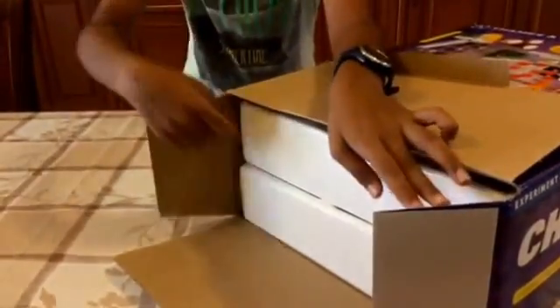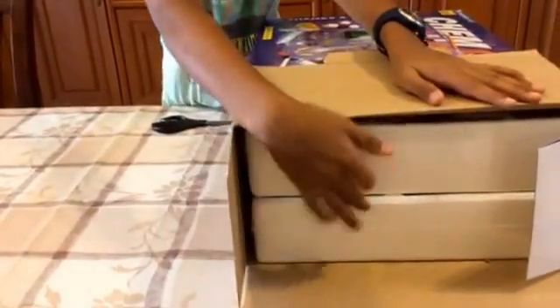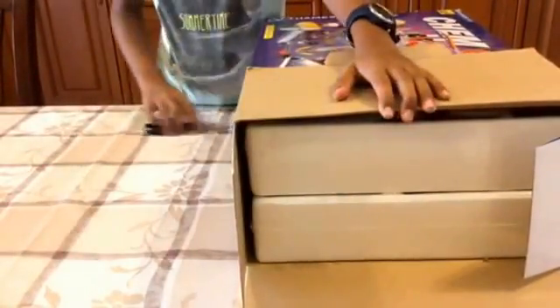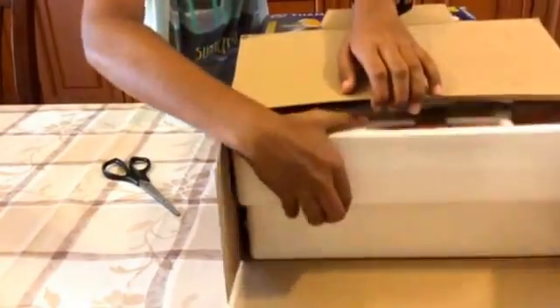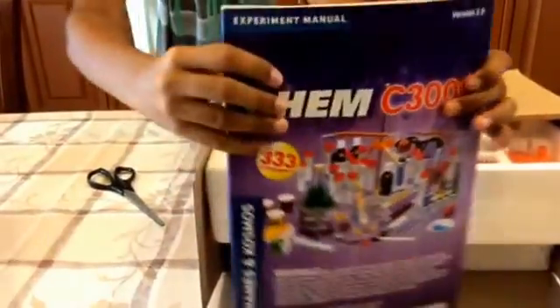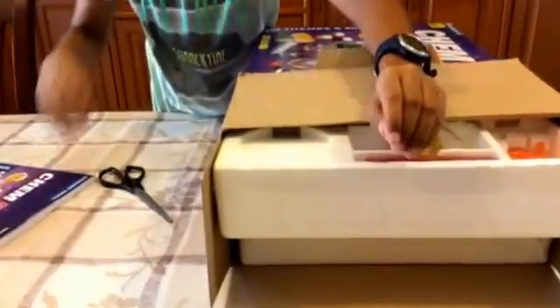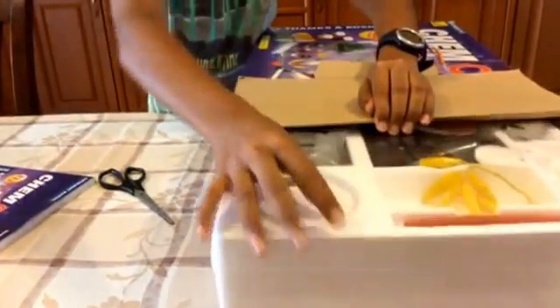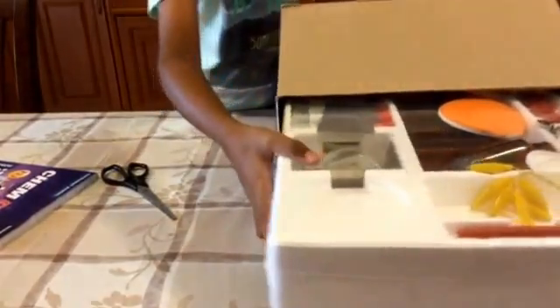Okay, that was easy. As you can see there are two compartments here. There's the instruction manual — we'll need that for later. Let's see what we have in here; it's quite big.